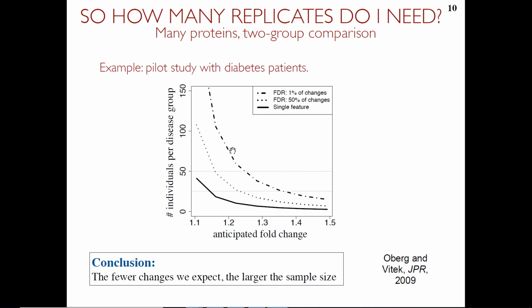I'm not saying ignoring them. I'm saying design an experiment which will allow you to reliably analyze those, which is not the same thing, right? What I'm saying with the filtering is that it depends on what you're going to do with the results of the study. But for example, there are a lot of opportunities for what is called non-specific filtering. Essentially you can filter out anything which does not depend on the changes in abundance between conditions. So for example, if you do some kind of MS1 quantification and you have an MS1 feature which doesn't have an ID, there's no point keeping it if you can't identify it and cannot work with it, right? Or you have features which are so close to saturation and don't have enough variation, no point keeping them there.